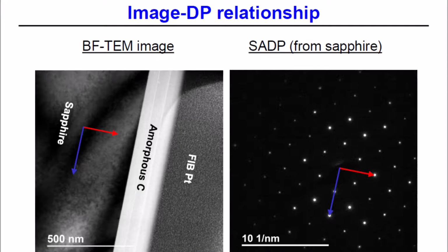Now the good news is that if you have a brand new microscope that's manufactured today, doing rotation calibration is completely unnecessary, because the engineering of the microscopes is such that this is accommodated into the technology. In other words, whenever you get an image and a diffraction pattern, you don't have to rotate one relative to the other to establish the parallelism.